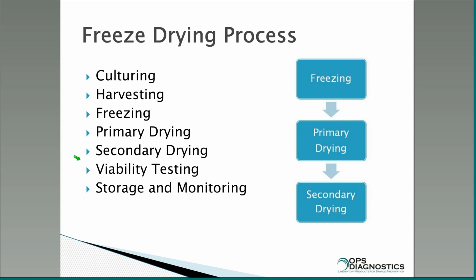Then you need to do viability testing. Do I have anything alive in my system? You can do this through something like a standard plate count, and there's an easier way to do that today. And then you need to store and monitor your organisms as well.